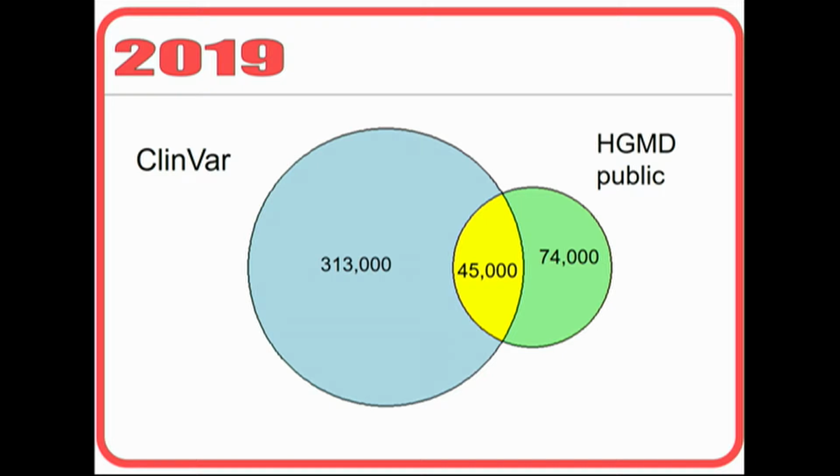It's got nothing to do with the browser, except that we're into data display, right? That's what we do, data display. And so this is an example of data display where you can do your viewers a favor. It's the kind of thing we think about when we're engineering the browser, trying to make things useful to you and intuitive. If you find something on the browser that's not intuitive, we have a mailing list. Let us know. We'd love to hear your thoughts.